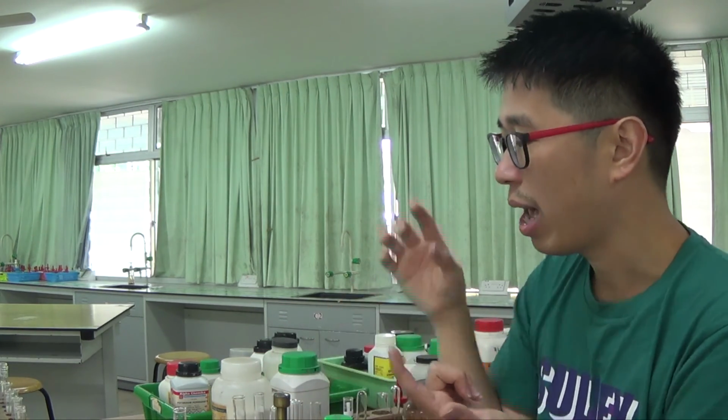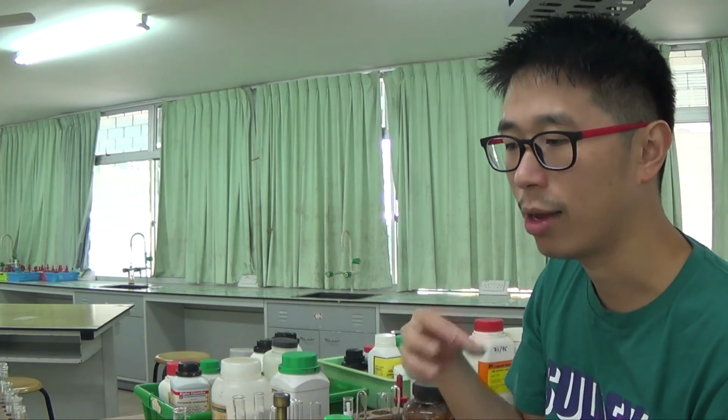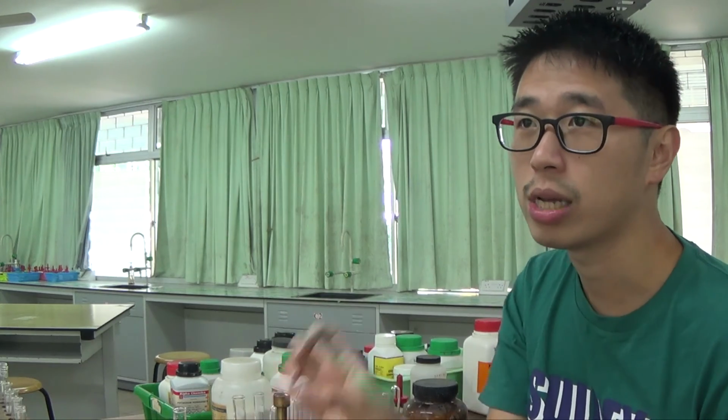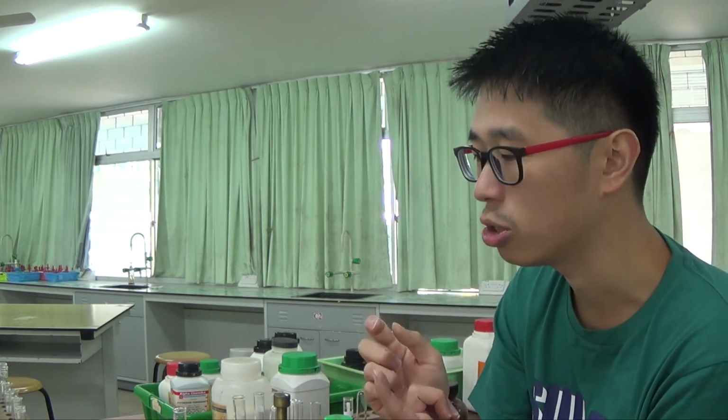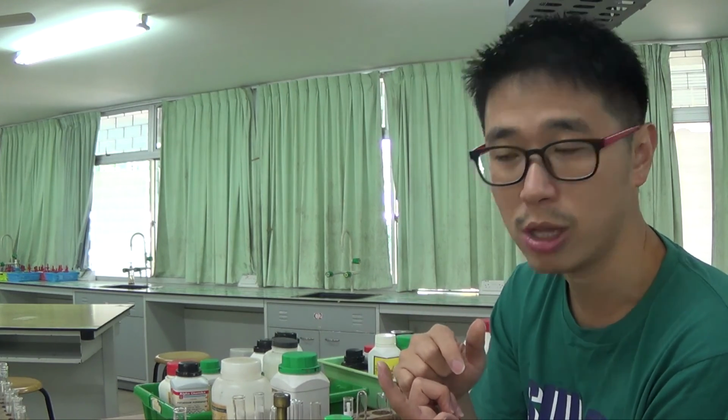But of course, we have ammonium ion. So how can we be sure that the ammonia gas does not come from ammonium ions? Those are things that I cover in my other tutorial videos on the qualitative analysis involving ammonium salt. So you can catch that particular tutorial video.